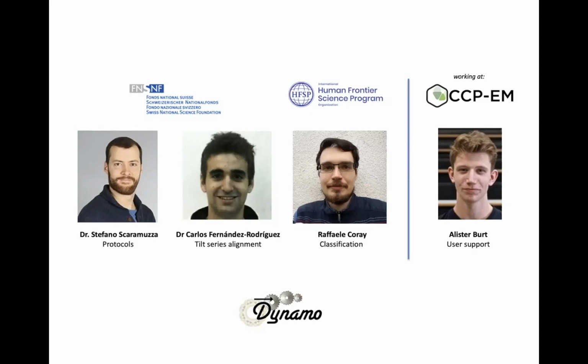Great. So on a slightly different topic, there were some questions on the computational aspects of it. You talked a bit on how it's set up with MATLAB. There was a question about compatibility with open source versions of MATLAB, like Octave, for example. I don't know if you've tested this, but does Dynamo run with Octave? Some of it will work, but I wouldn't advise it.